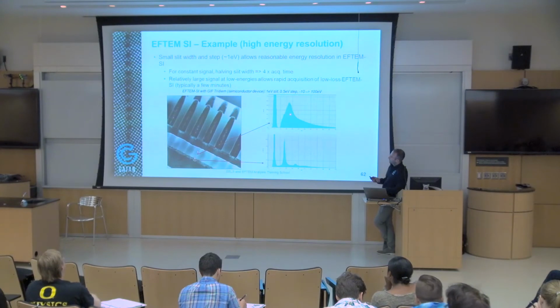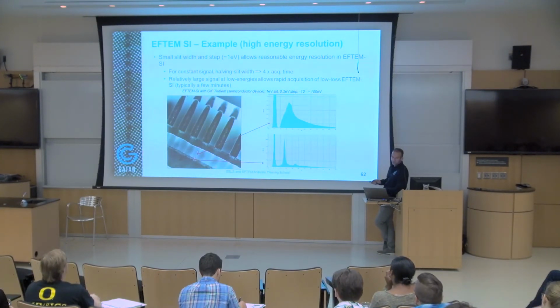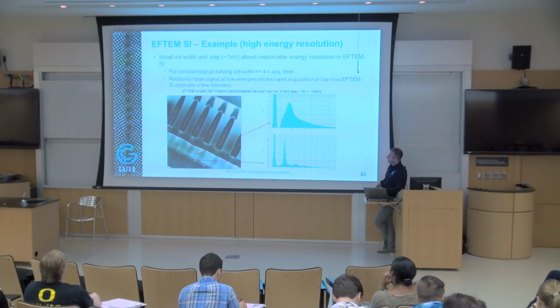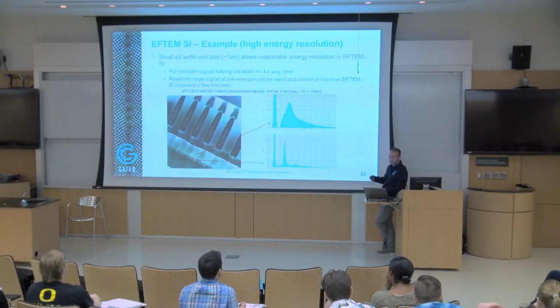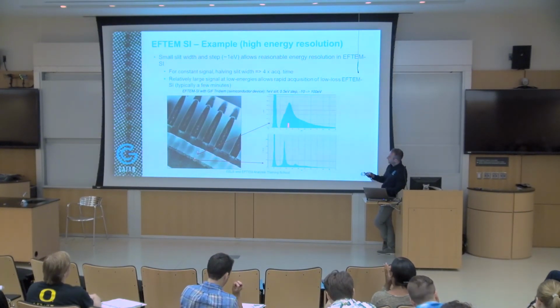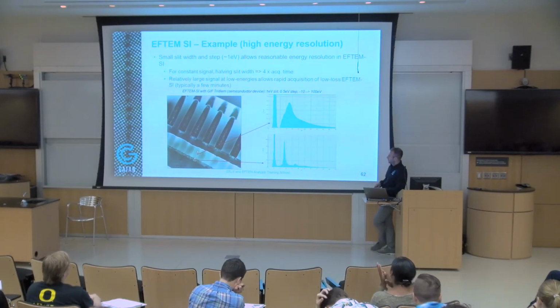And I can tell you right away, if you're working on silicon, this is silicon oxide, this is bulk silicon. So you don't have to do any quantification. This is actually the fastest method to do any sort of chemical analysis, just looking at different chemical phases. It's very well used in the microelectronic industry because people are interested in silicon and silicon oxide. So right away you can tell that this one is silicon oxide, this is bulk silicon.